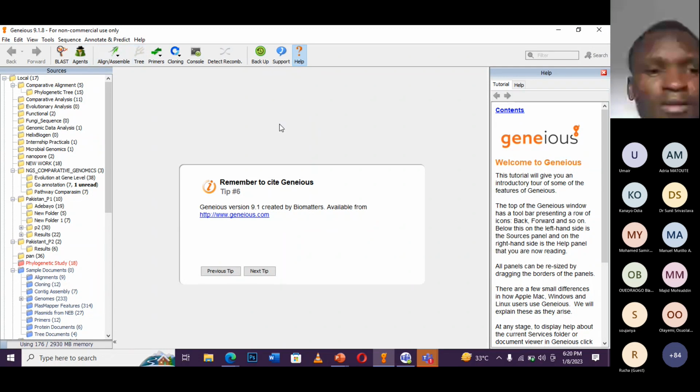This software tool can do transcriptomics analysis, genomics analysis, metagenomics analysis, protein primary structure, protein design predictions, and variant sequence analysis, where you try to study cancer genomics, understand variant point mutations, and do virus analysis. When it comes to virus genomics analysis, you can actually use the software. It is widely known and used because it has a whole lot of tools embedded in it that you can use individually.